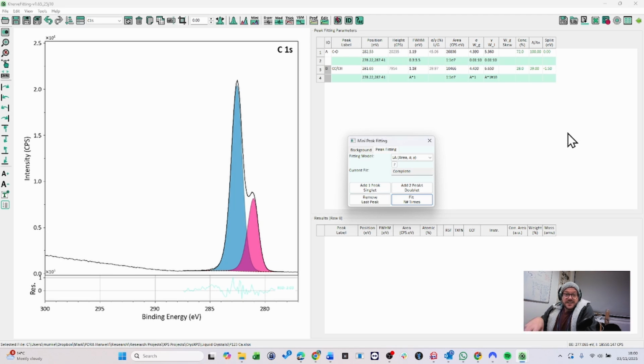So that's a nice and really simple system that you can try something similar with, try some carbons. We're going to have a look at some doublets now and just make sure that we're all aware of what parameters we need to control and what curve fitting can do to make sure that your data is modeled to the highest standard that is possible.